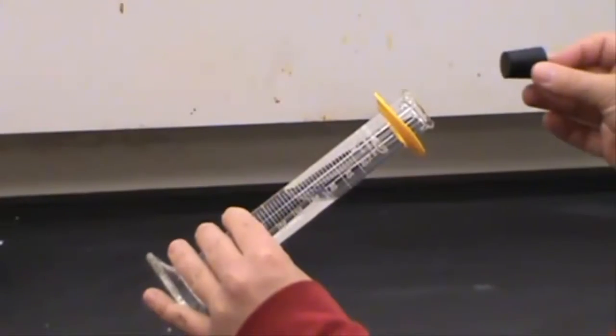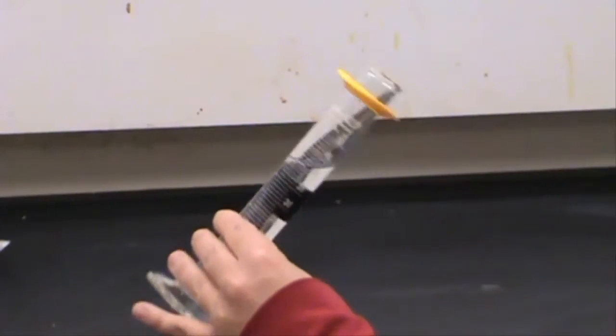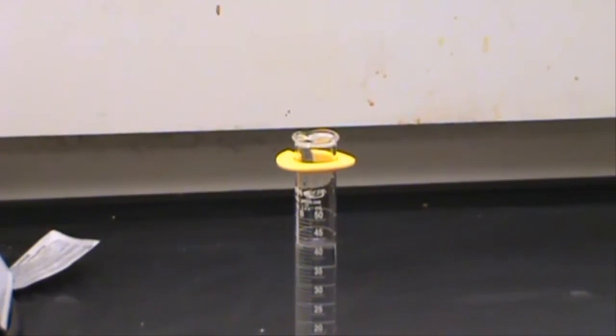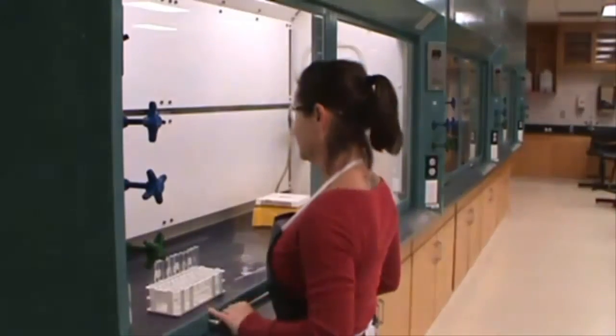Solids are a little tricky to measure the volume. You could use a ruler and use some math, or you could do the following technique. Tilt the graduated cylinder and gently slide the stopper into the water. Now record the new volume as the total volume of water in cylinder plus stopper. The difference between the new volume and the old volume is the volume of the solid. This is called displacement. Now that you know the mass of the solid and the volume of the solid, you can calculate the density.